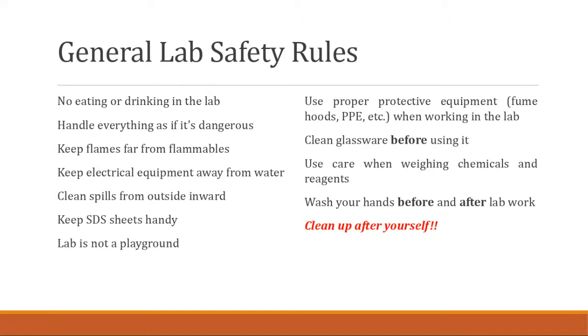And the nitrile gloves protect you for a certain amount of time. So if you've been wearing these gloves for 2 or 3 hours, you do have the propensity of having some of these chemicals in low quantities penetrate through the gloves. They can get into your hands. And if you're going around touching stuff with these gloves, you might be protecting yourself, but you're not protecting others.